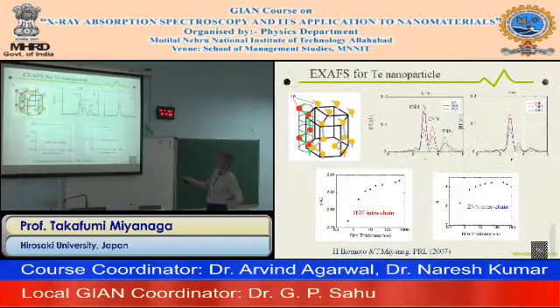The low temperature EXAFS shows the first nearest neighbor is the covalent bond. The second nearest neighbor peak is the interchain correlation, and the third one is another intrachain peak here, and the fourth, and so on. For the nanoparticles, the first nearest neighbor appears, naturally, and the second nearest neighbor is very small, and the third no longer appears for the high temperatures.